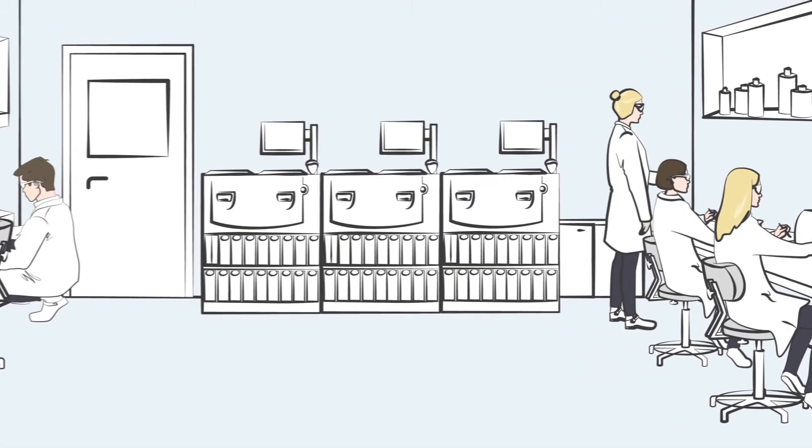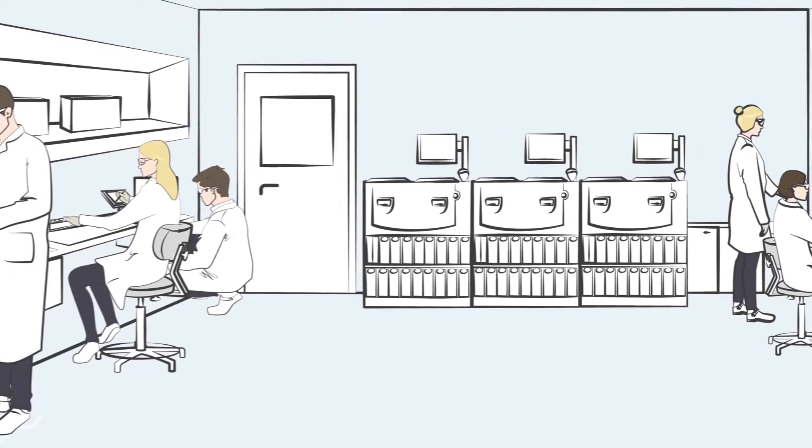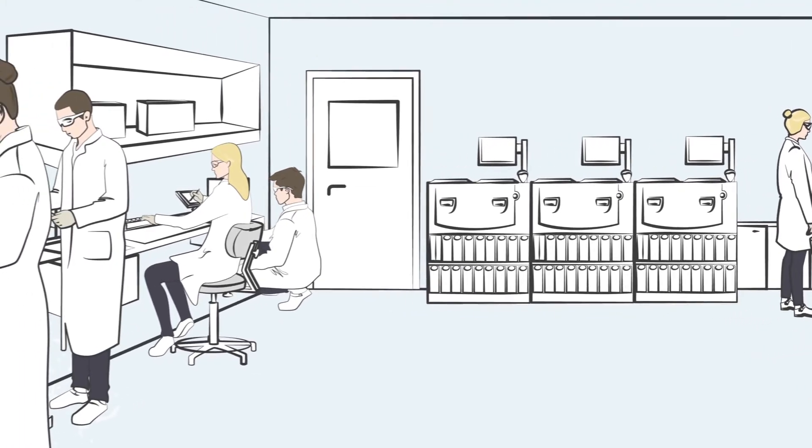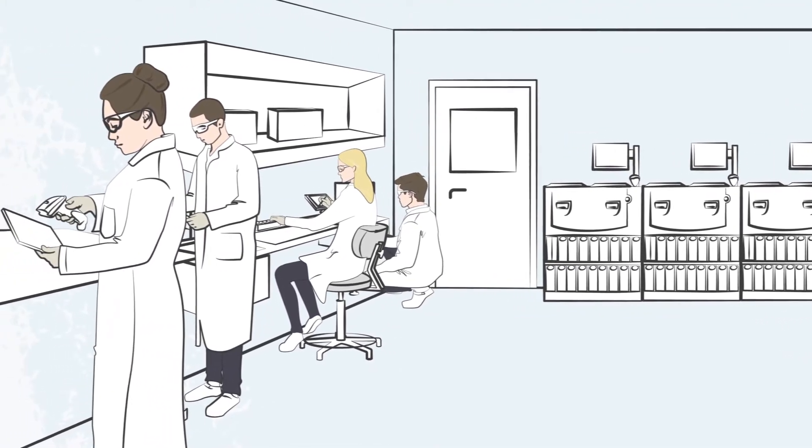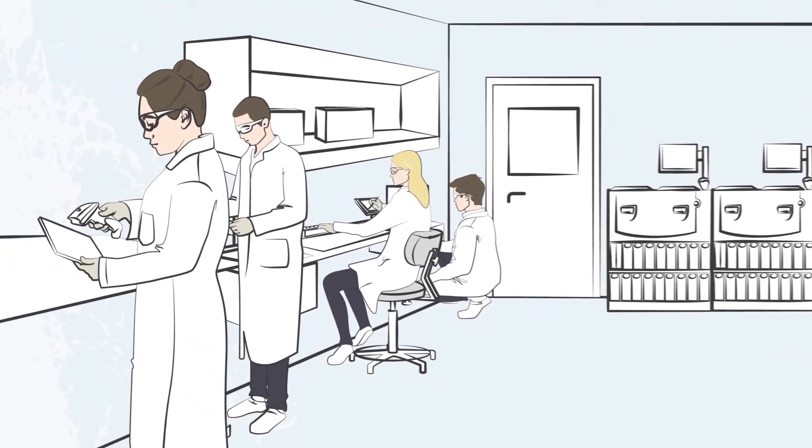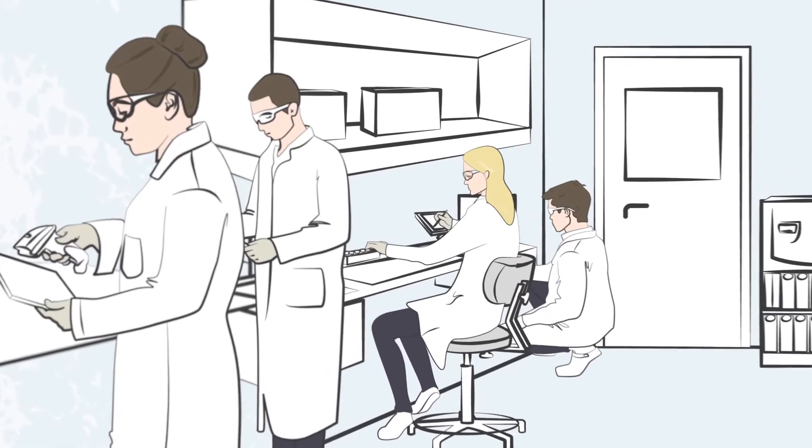Today's pathology labs face multiple challenges, including rising case numbers, maintaining quality standards, and the expectation for decreased turnaround time.